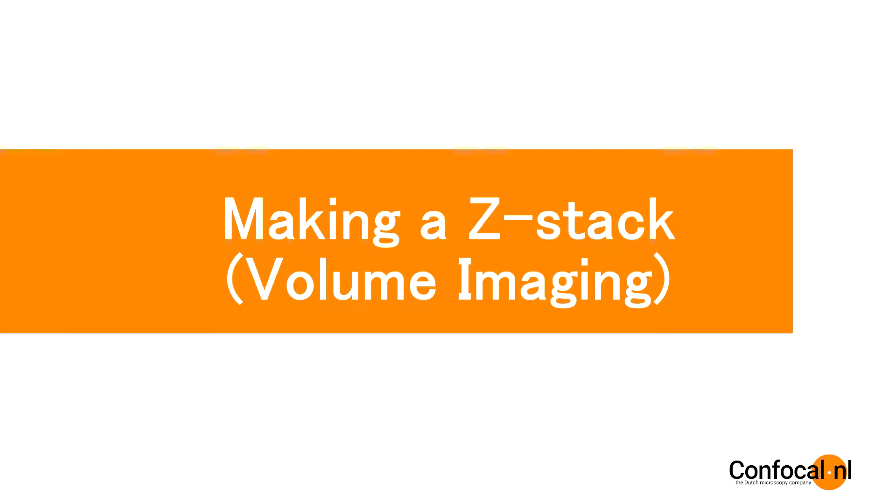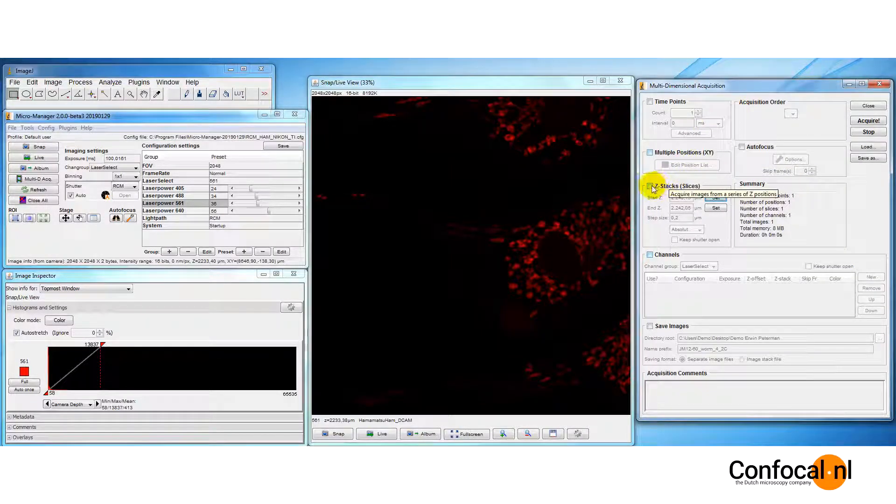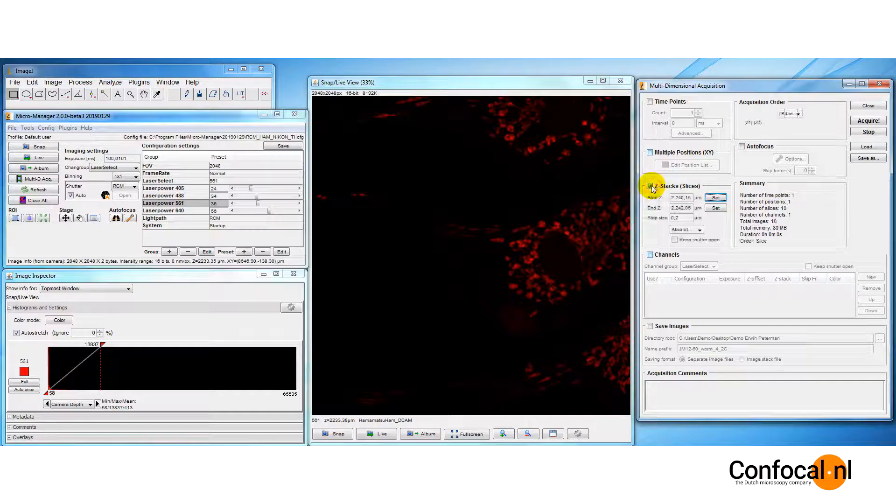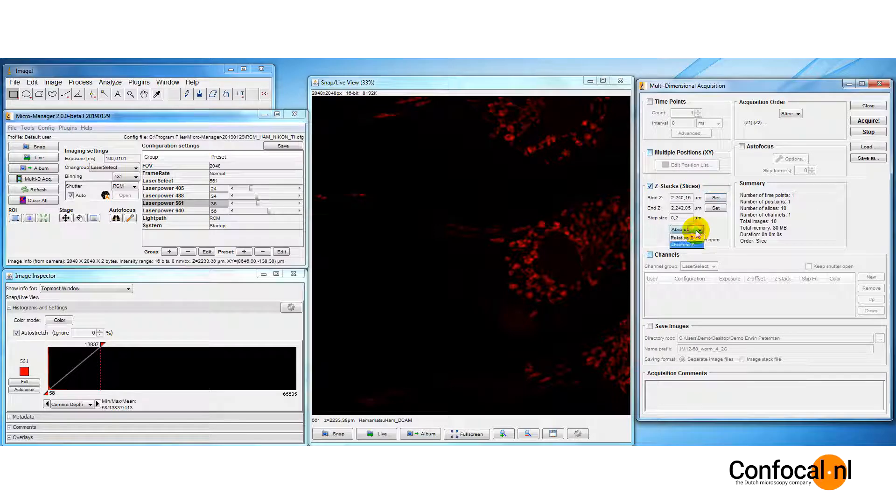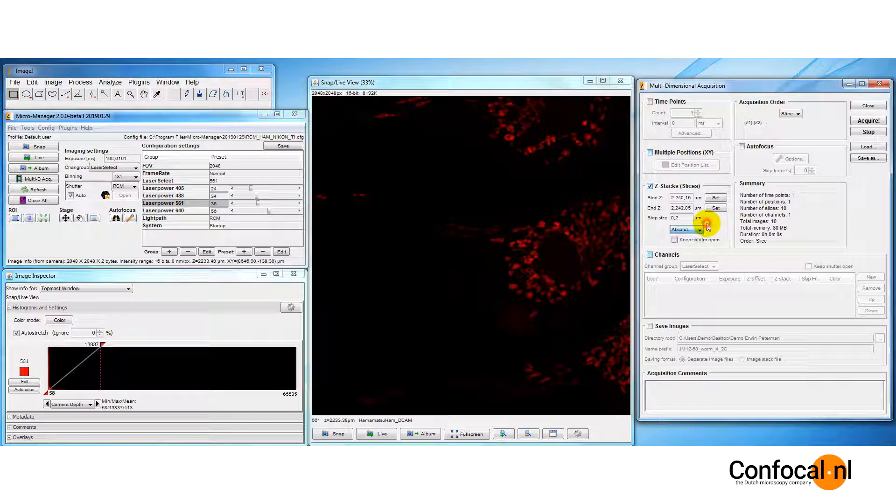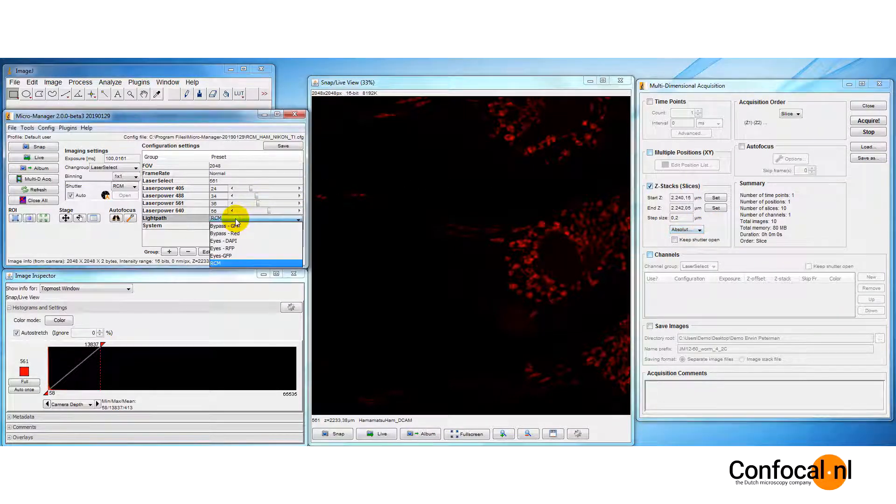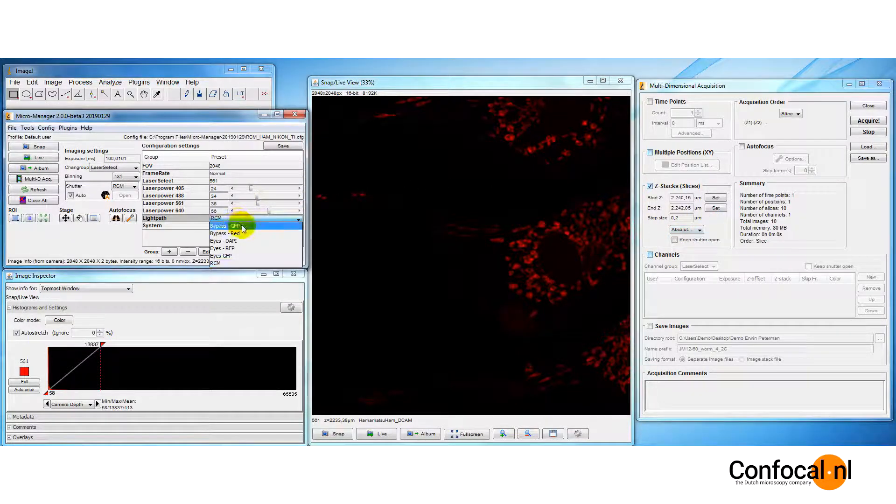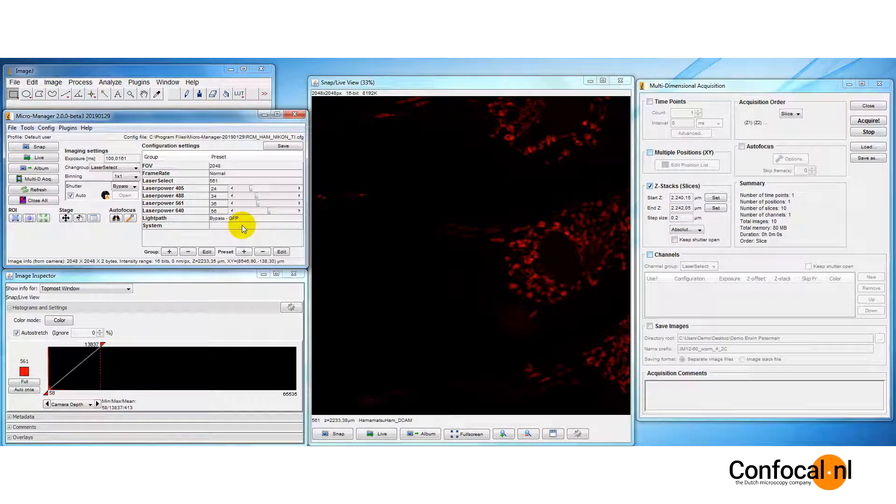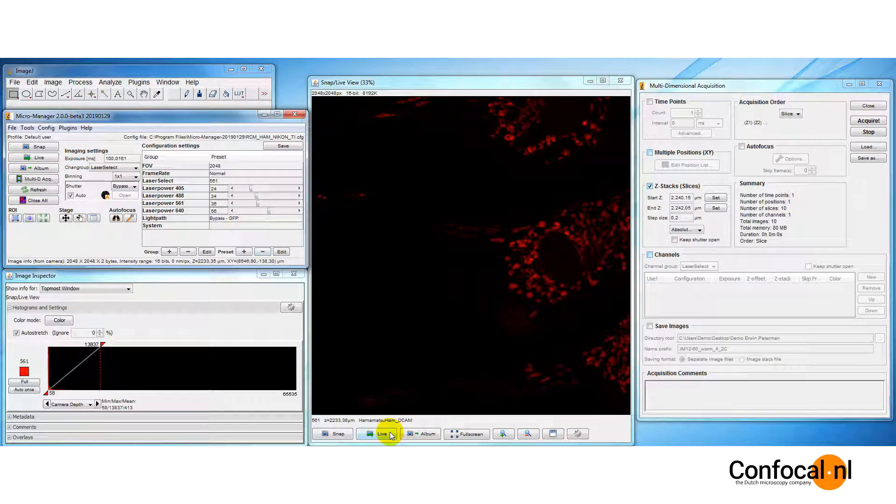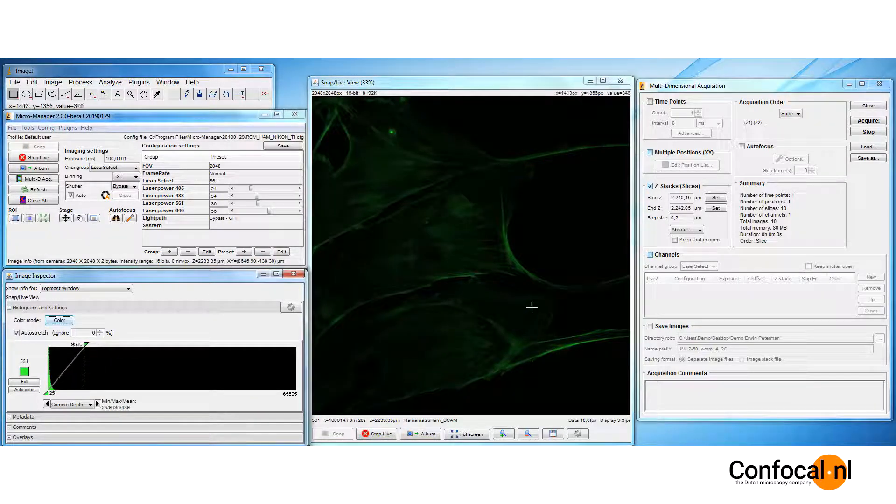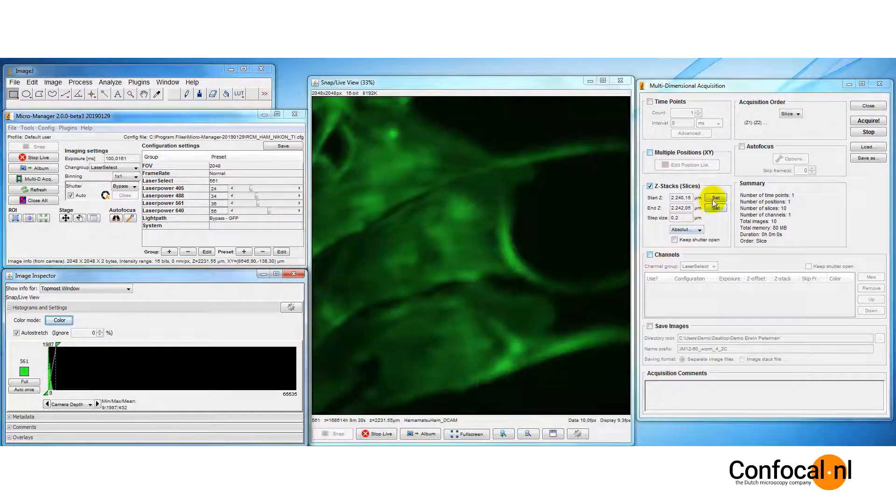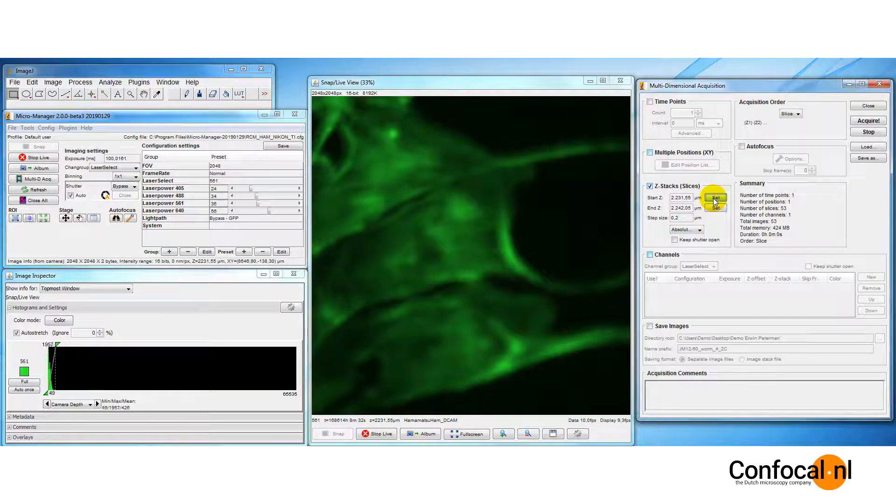Let's perform a z-stack. Activate z-stack in the multi-dimensional window. We can choose to set the volume in two ways. In the absolute z mode, you define the top and bottom of the volume. We will go by the absolute z mode. We can make use of the bypass mode to quickly run a live scan. Find the lower limit by taking the objective down. Click set.